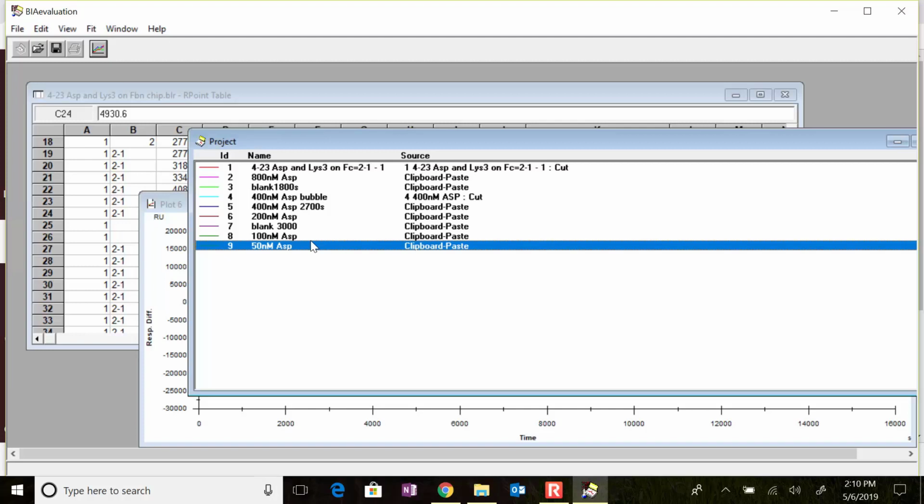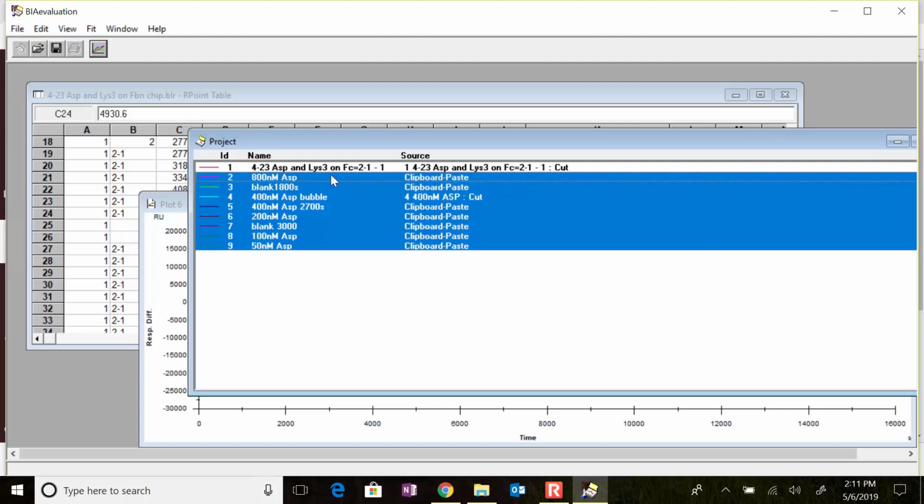If I was better at keeping track of where I was, Control-C would work just as well. But because of the zooming feature, it's a little bit clunky, and because you're having to do so much with the data, that's what I've done. These little things, though, you can definitely choose your own way to do things.